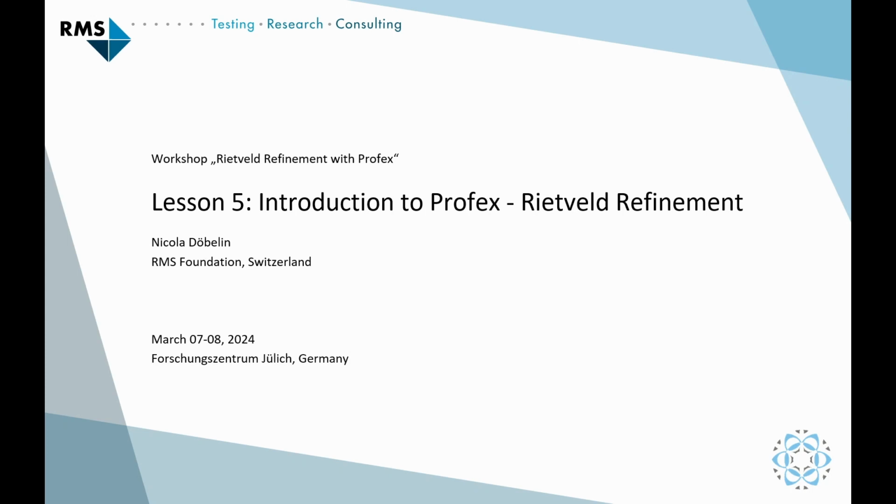Good morning. Yesterday we learned a lot about the theoretical processes behind X-ray diffraction, and we also learned how to identify phases with Profex or with other software. And with this, we now have everything we need to actually perform a Rietveld refinement.